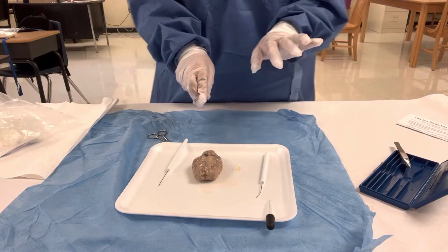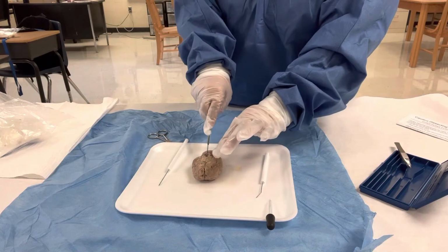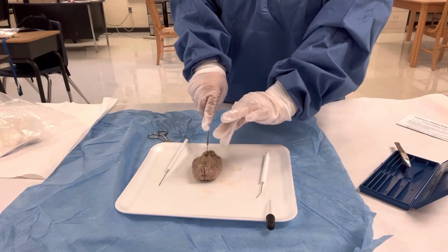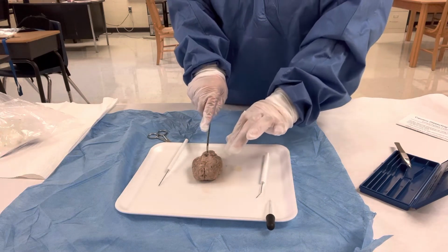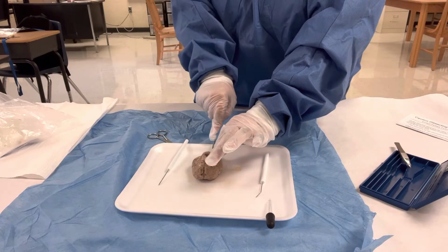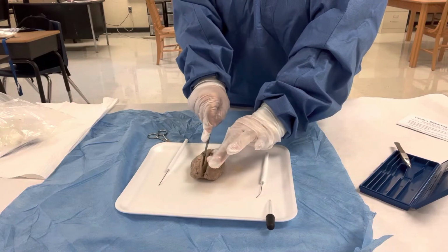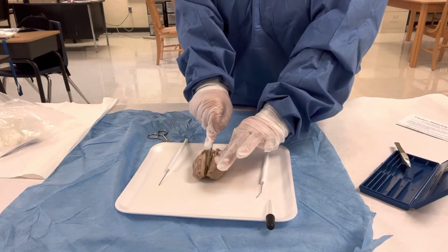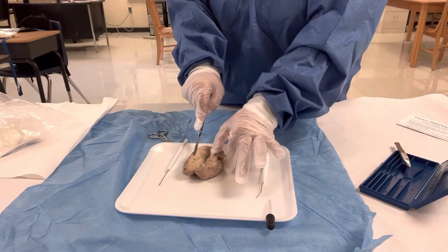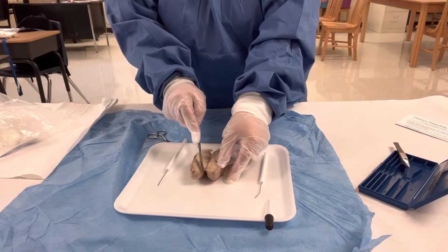This is so gross. Oh, Jesus. Oh, Lord have mercy. I'm cutting it on the longitudinal fissure. I can't say that fissure. It separates the two cerebral hemispheres. Oh, Lord have mercy. Jesus. This is just not my forte. Lord have mercy. Oh, Jesus. Okay, so let's see.